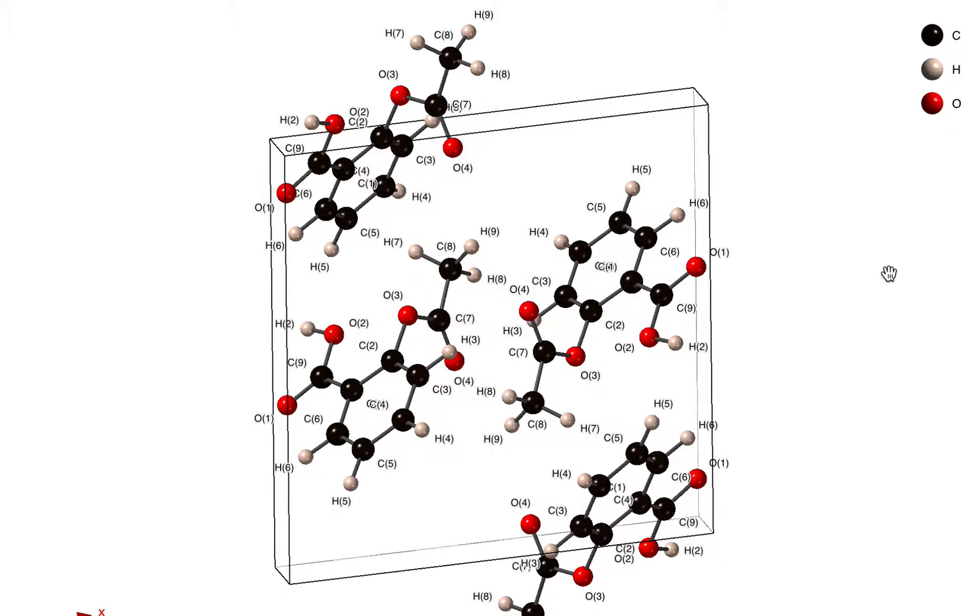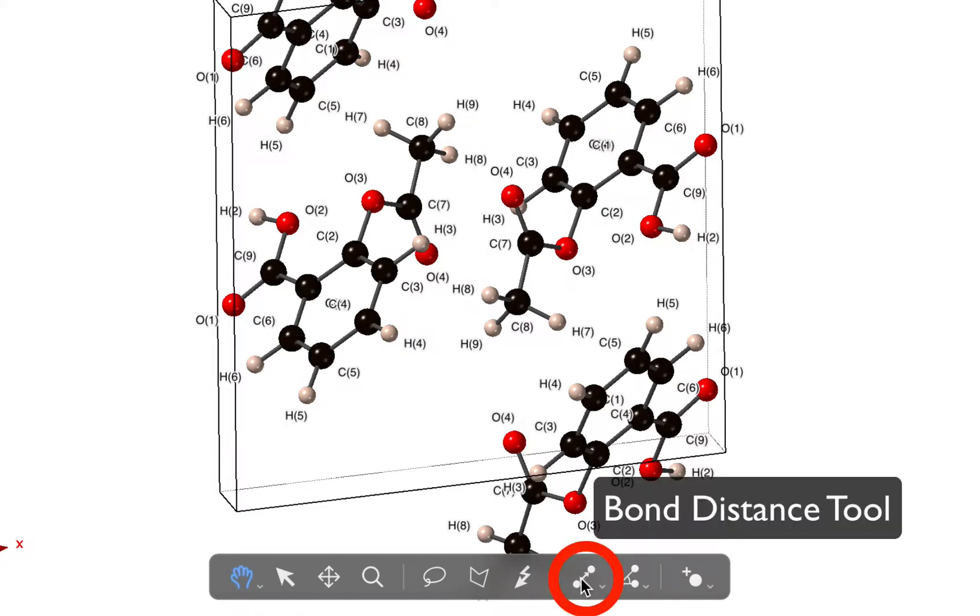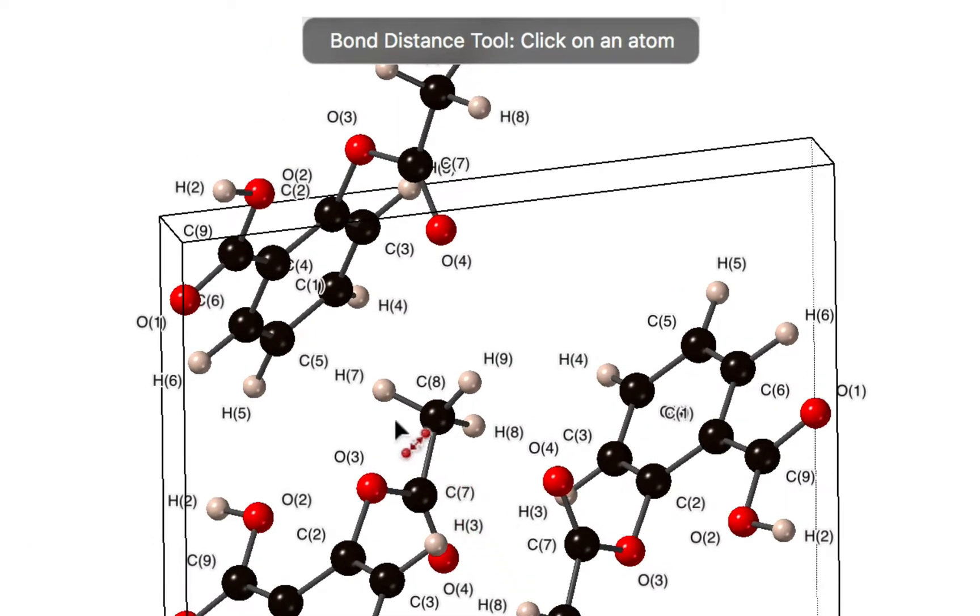Now the next thing you might want to do is measure some distances between atoms. An easy way of doing that is to move down to this tool strip at the bottom of the screen and we'll choose the bond distance tool.